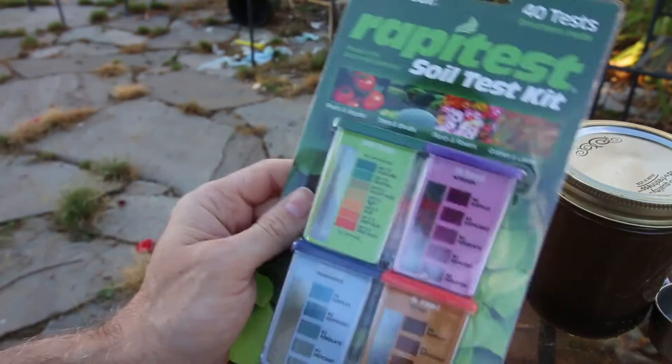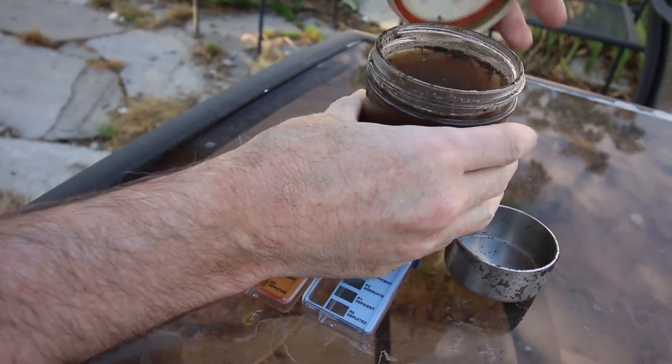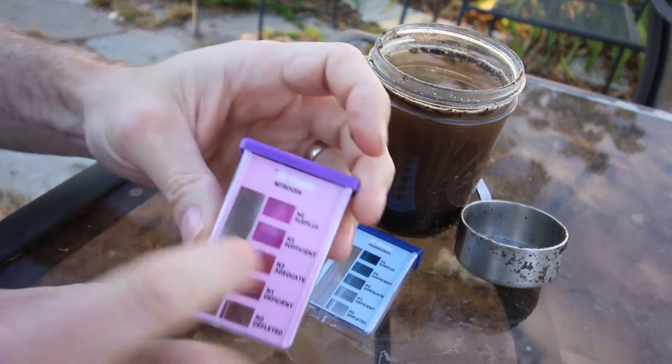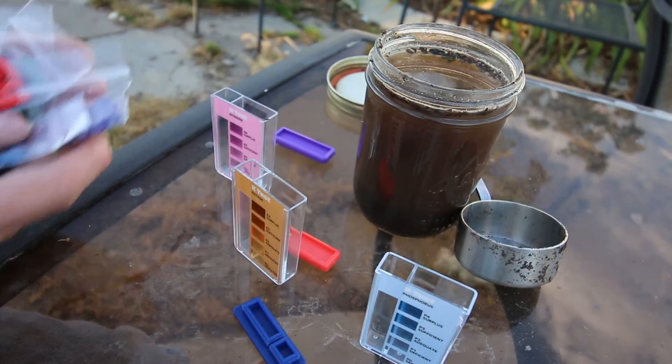This is the soil test that I'm using — it's a rapid test, cost me under $20 for all of these. There are little pill capsules that you just open up and pour the contents into these containers.